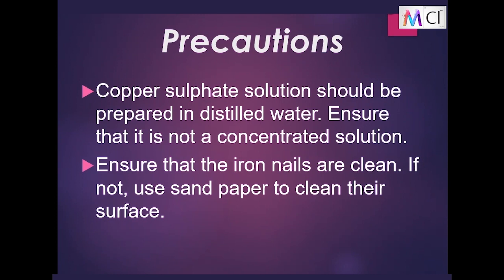Precautions. Copper sulfate solution should be prepared in distilled water. Ensure that it is not a concentrated solution. Ensure that the iron nails are clean. If not, use sandpaper to clean their surface.